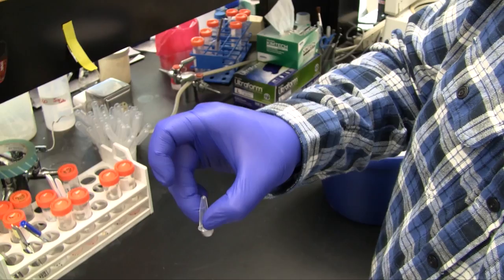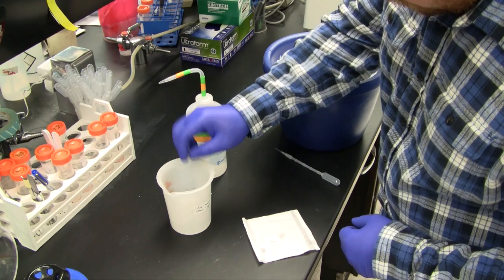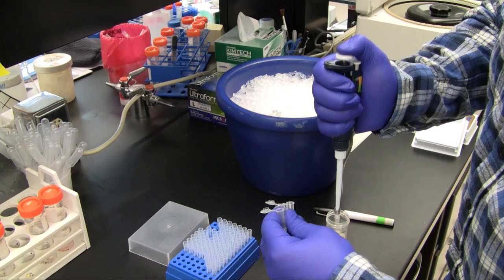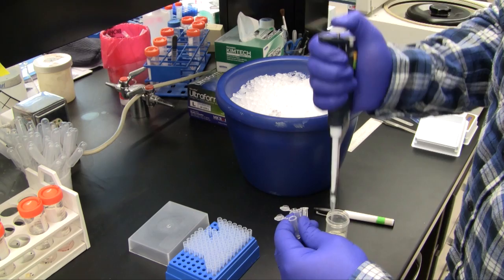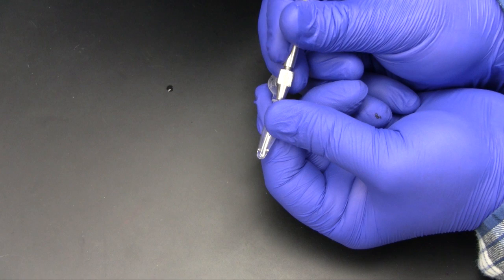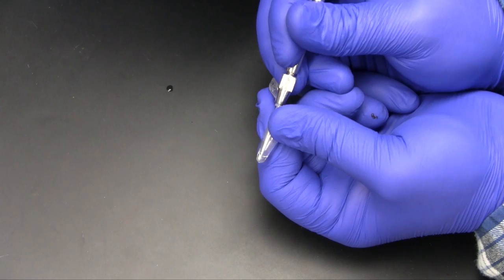After the final ethanol rinse, the liquid is removed by inverting the tube and blotting. Ethanol can be teased out of the tube with a pipette tip for more stringent applications. 20 to 30 microliters of acetic acid or other spreading solution is then added to the tube. The digested meristem tissue is rolled against the inside of the tube with a blunt dissecting probe to free the individual cells. The solution is stirred to distribute the cells. Tubes are returned to ice while the other samples are being processed.